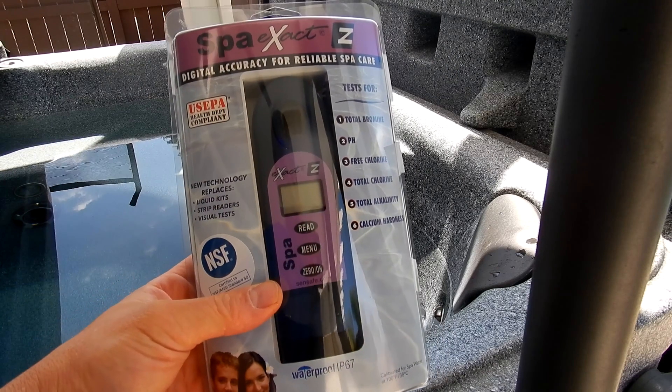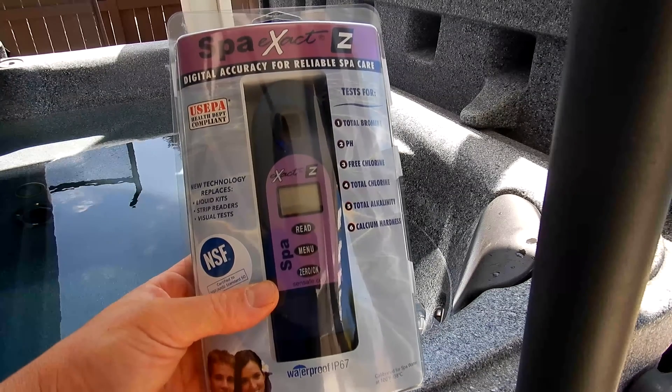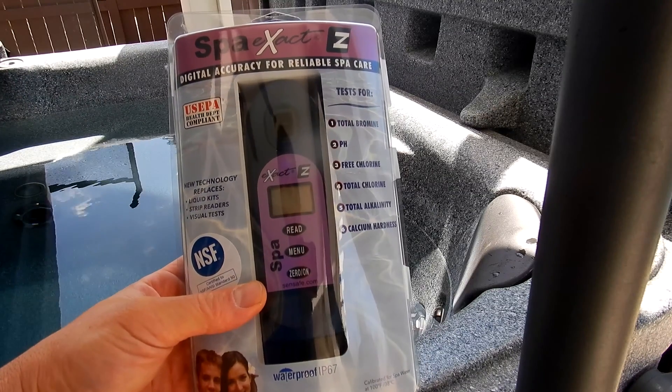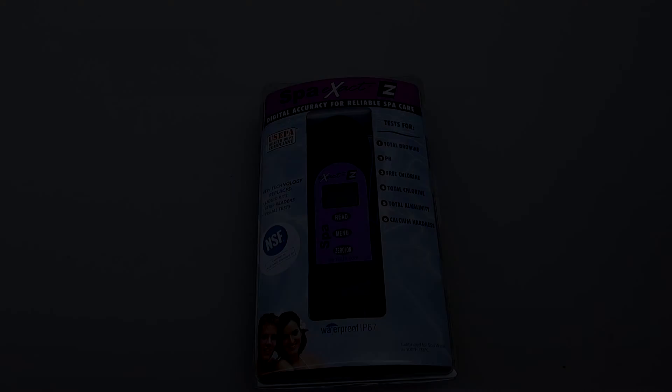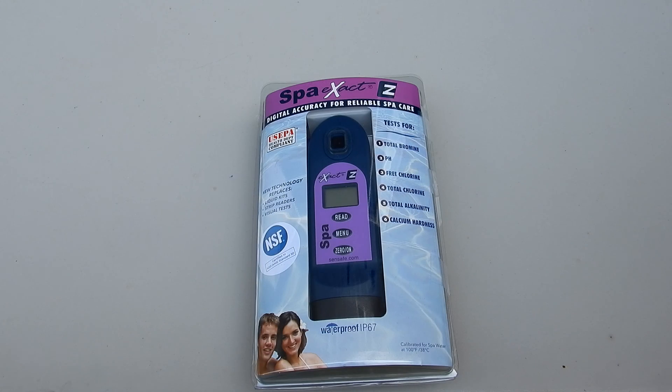If you have a spa or hot tub, the Spa Exact EZ would be a great tester for you. It's a photometer tester that will give you exact readings on all the test factors for your spa. Let me show you the setup and use of the Spa Exact EZ.